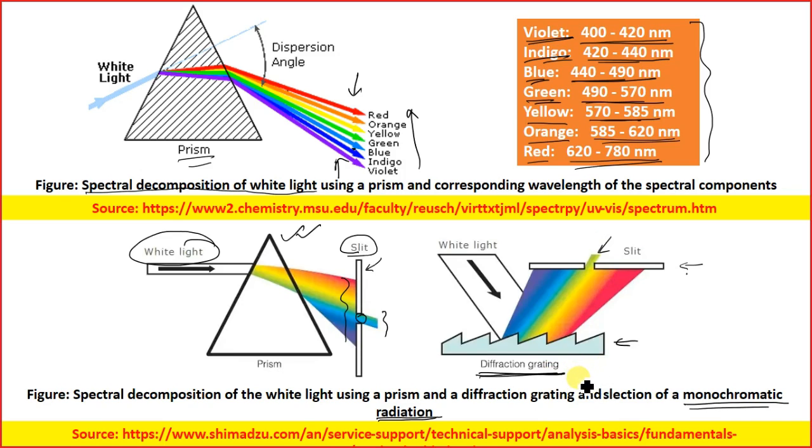In fact, the costly spectrophotometers usually employ diffraction gratings in comparison to the prism. The reason being, while you are passing the white light through the prism, it is basically a matter. This glass should also be absorbing some of the radiations, so the radiation which is getting out will have a lower amount of energy.